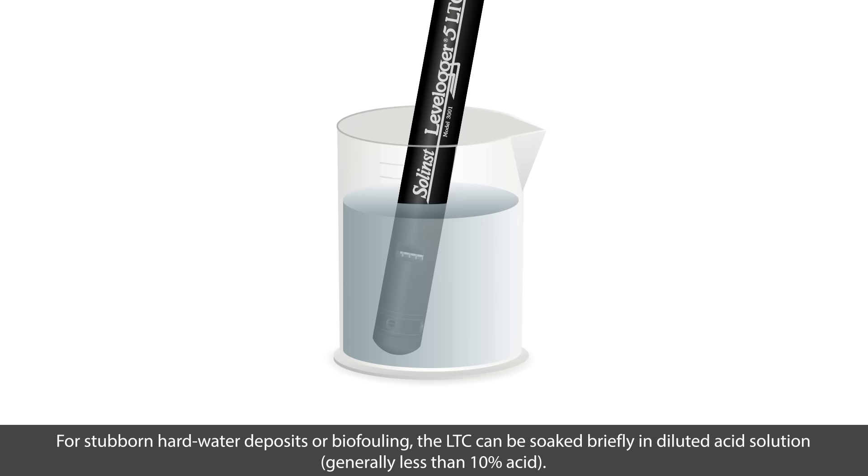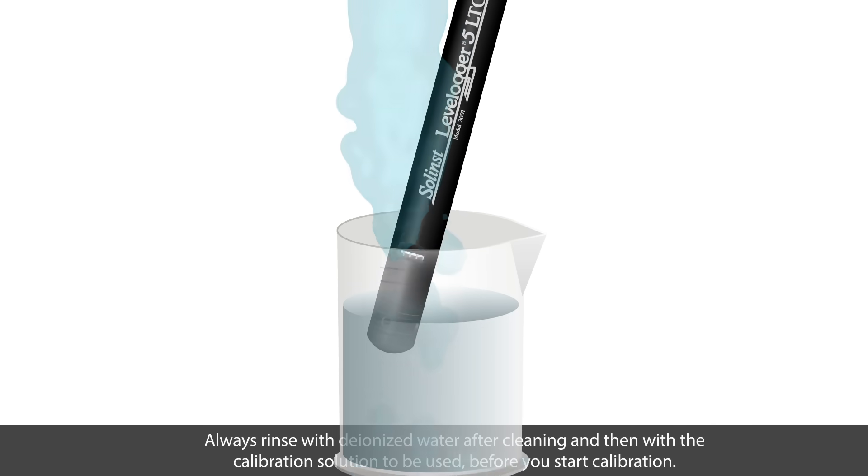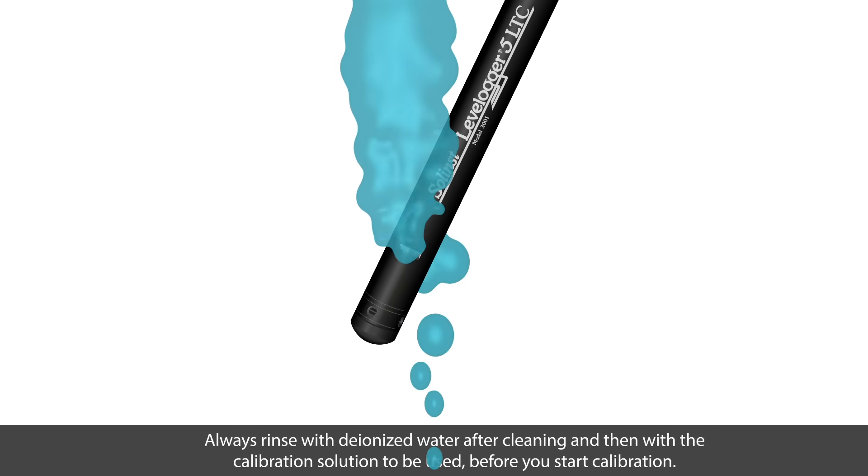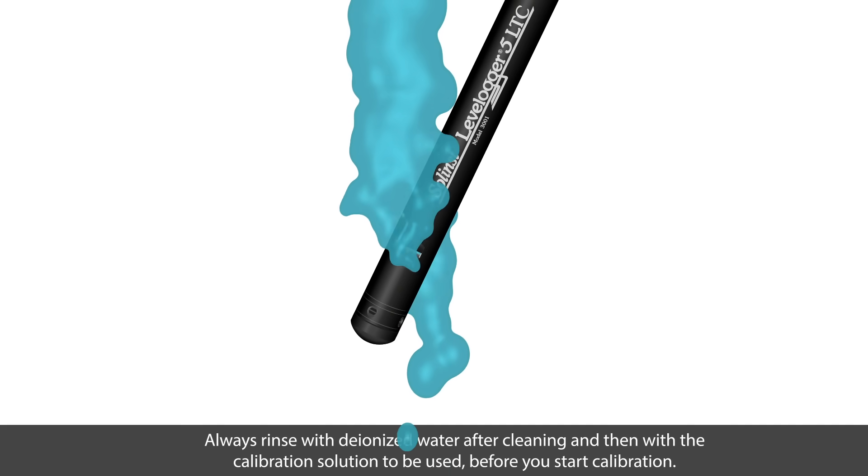For hard water deposits or biofouling, the LTC can be soaked briefly in diluted solution of less than 10% acid. Always rinse with deionized water after cleaning and then rinse again with the calibration solution to be used before you start calibration.